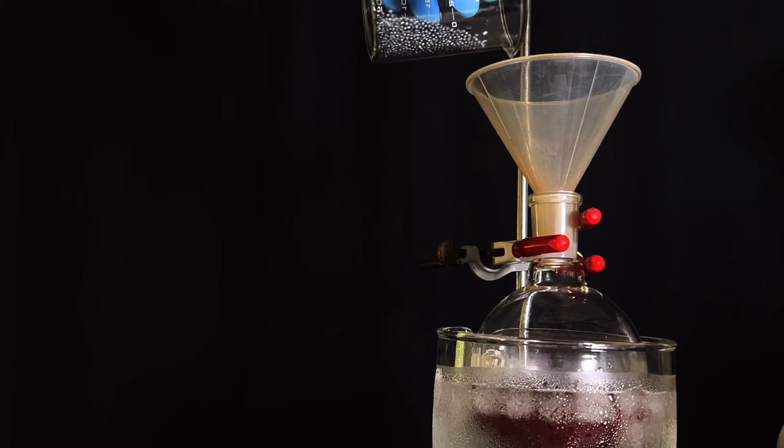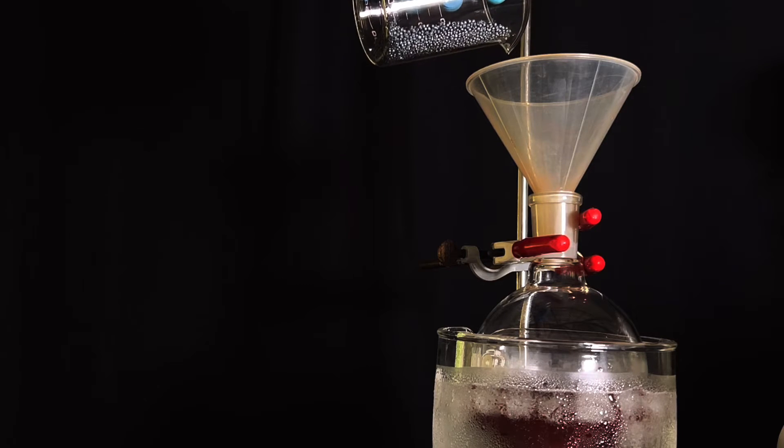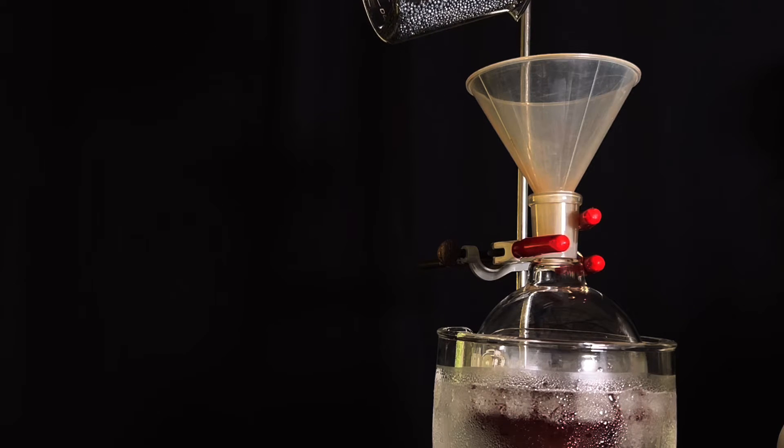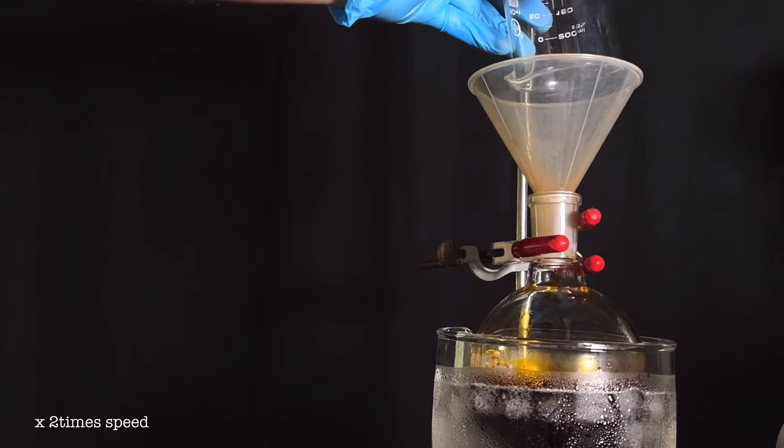Next using a powder funnel, 83.3 g of iodine crystals were transferred to the chilled methanol. Iodine crystals quickly dissolve in methanol and the resultant solution is deep red to almost black in color.